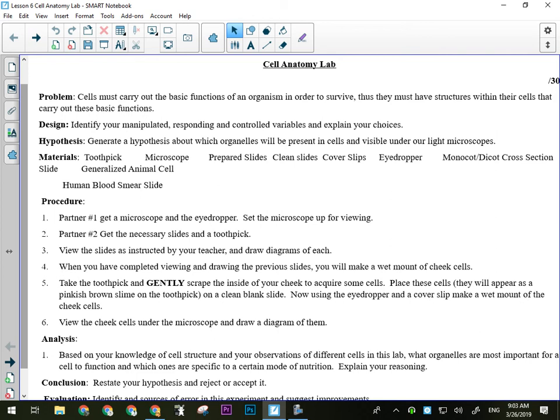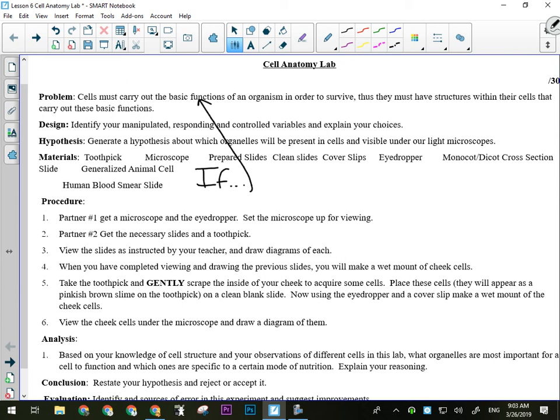All right, for our hypothesis, our if, and then statements. Okay, the if part should probably talk about what cells do. Spoiler alert, that's like this. Okay. The premise we're working on is that that's the job a cell does. So the premise is always the if part. Okay. The and part describes the experiment. In this case, we are looking at cells from different kinds of organisms.